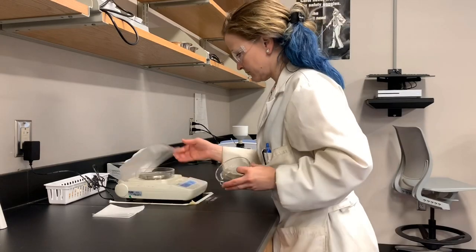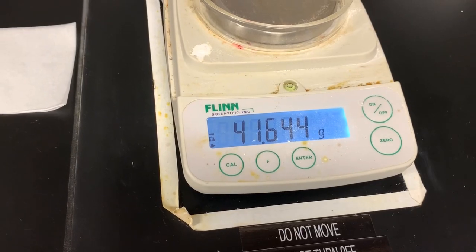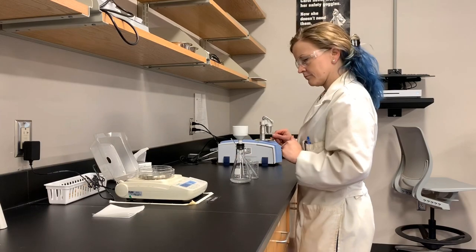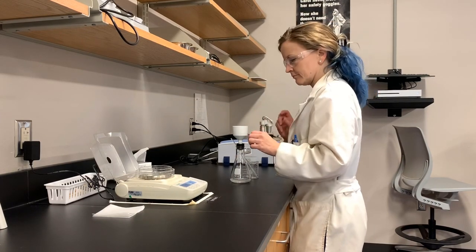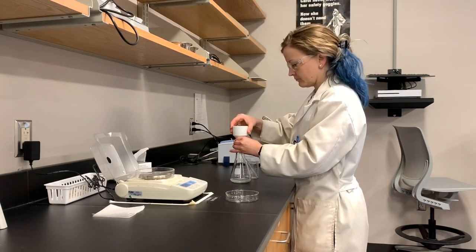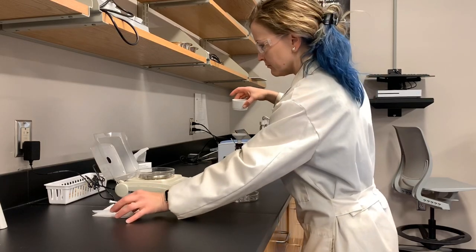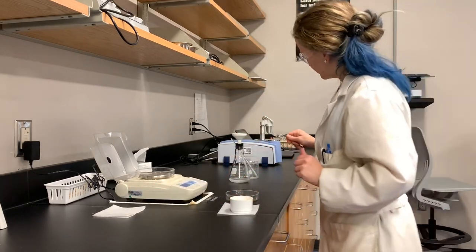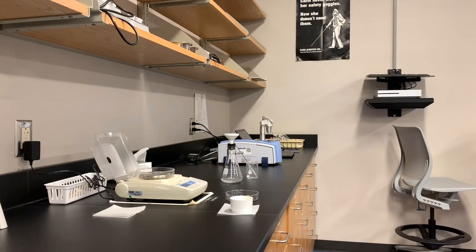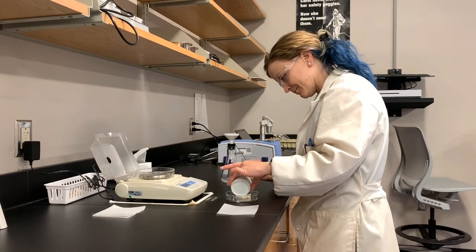Then we were supposed to weigh our product. First I tared the crystallizing dish that I weighed it into and then I got the mass of the product. I did tare the balance, so the value you will see as the mass of the product is the actual mass of the product — you do not need to do any subtraction. These numbers, however, are really important for you to write down in your lab notebook under your observations.